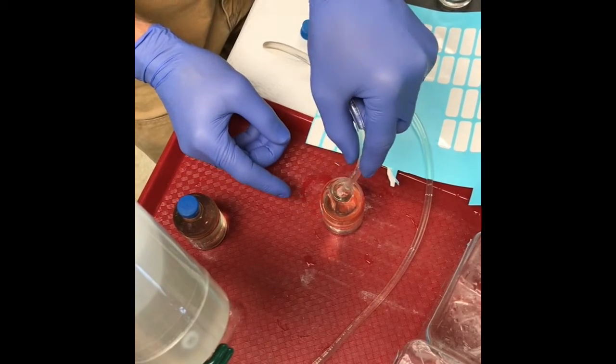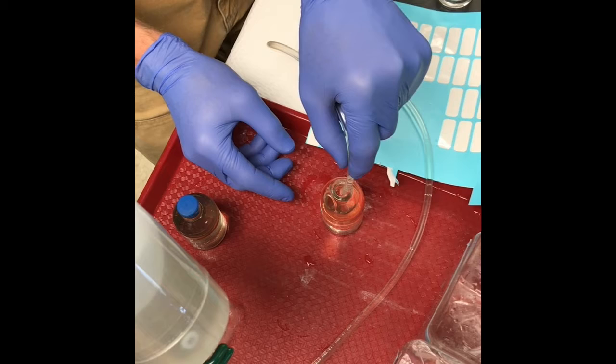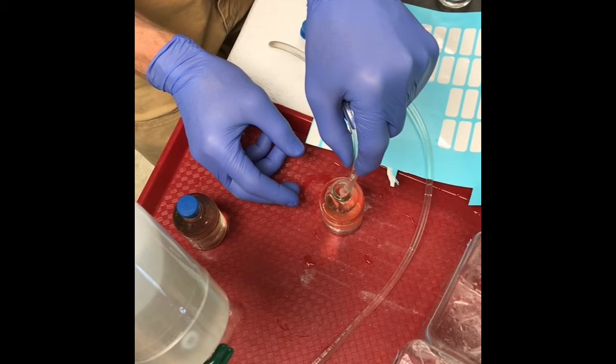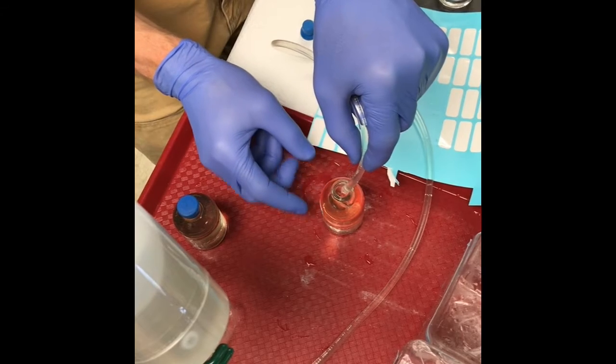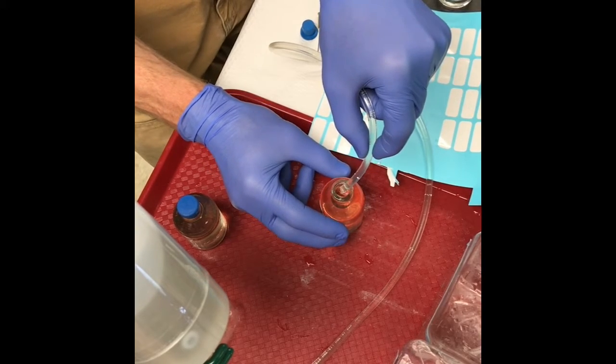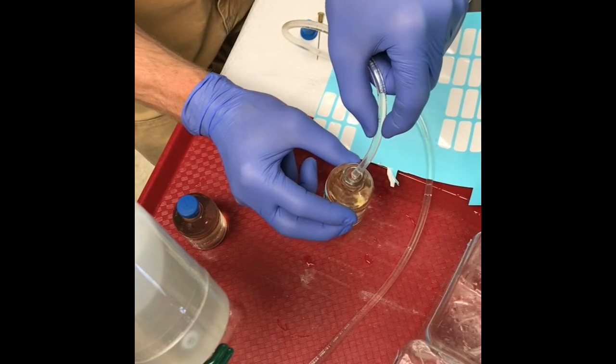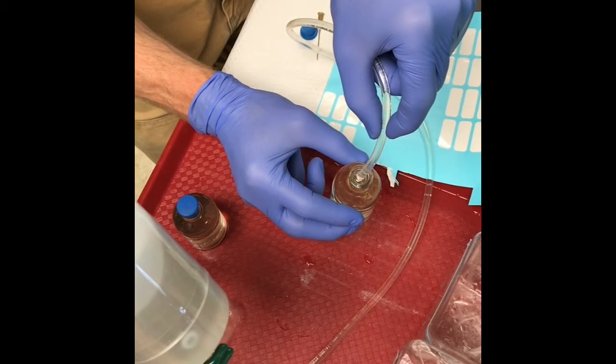I've already preloaded this bottle with two milliliters of one molar zinc acetate to preserve the sulfide, then labeled it. I'm filling it up to about halfway through the neck of the bottle because we're going to try to get all the air bubbles out.